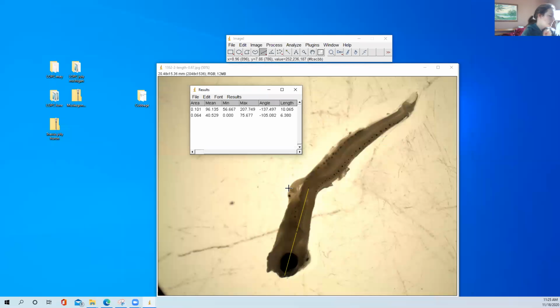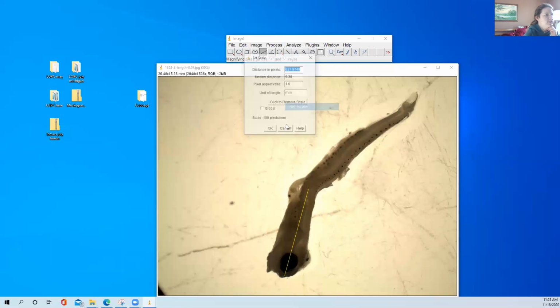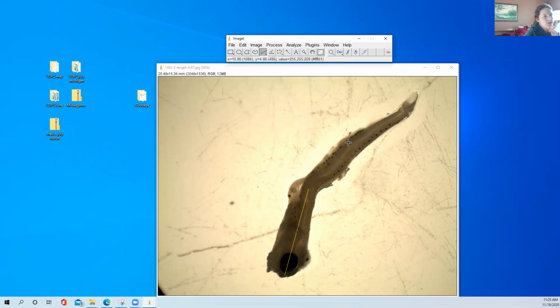It's pretty easy. I'm going to send you guys the calibration, so these different set scale ratios for each of the magnifications. And I'll also figure out how to send you all the pictures I want you guys to do. And we're all going to do the same pictures. Make sure you do these measurements before Thanksgiving, so like Wednesday at midnight.